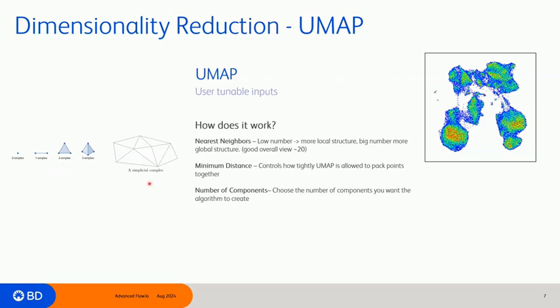As neighbors start to increase, UMAP manages to see more of the overall structure of the data, and it glues together more of those components to better convey the broader structure. By the time we reach neighbors of around 20, we have a fairly good idea of the overall view of the data, showing how various colors interrelate to each other over the whole data set.